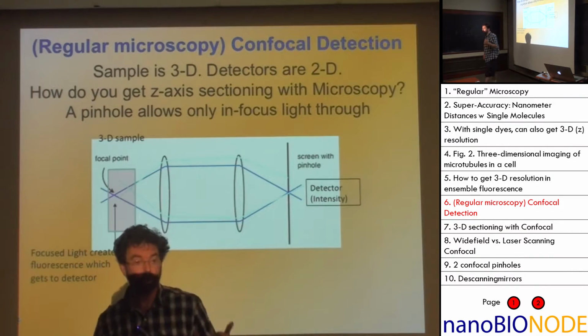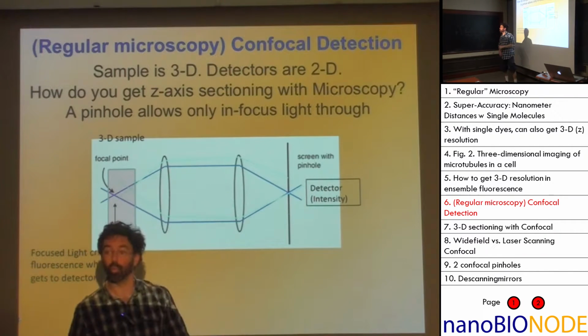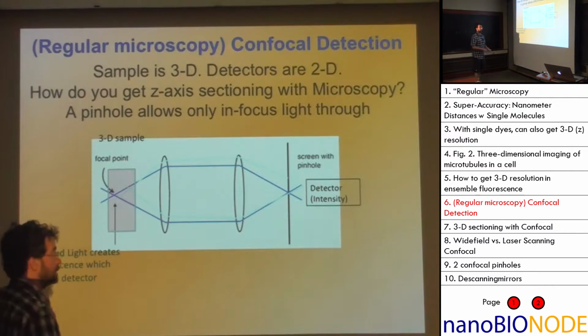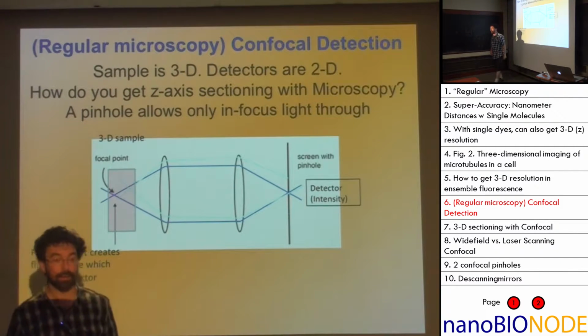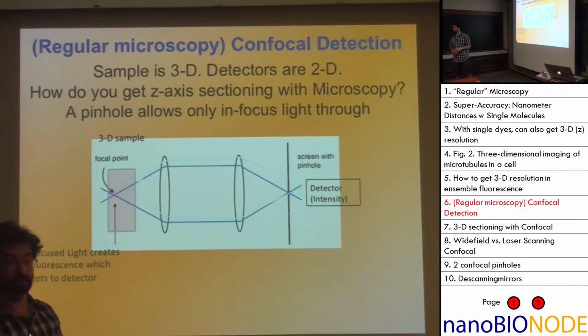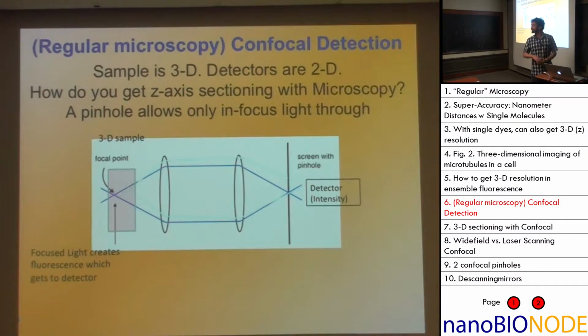And in fact, one of the things that you have to decide is what size pinhole you want to use. In fact, you can pick lambda over 2. You can even go somewhat smaller sometimes. What's the advantage or disadvantage of picking lambda over 2 or smaller or bigger? Diffraction? Yeah, go ahead.